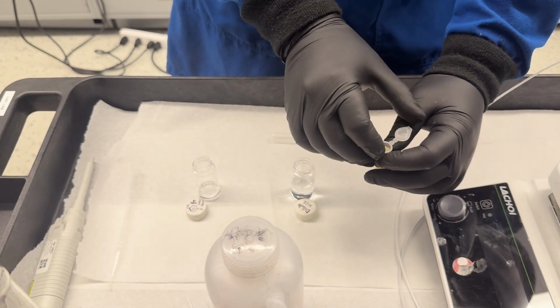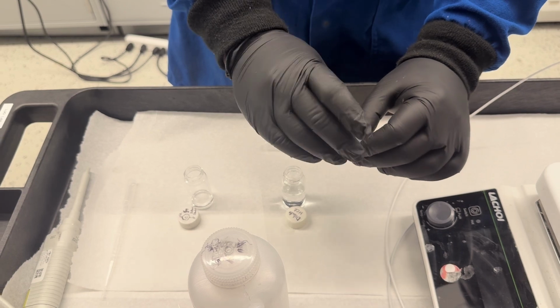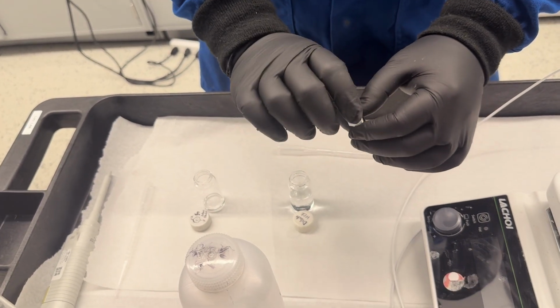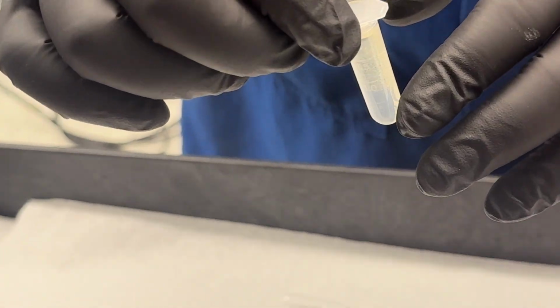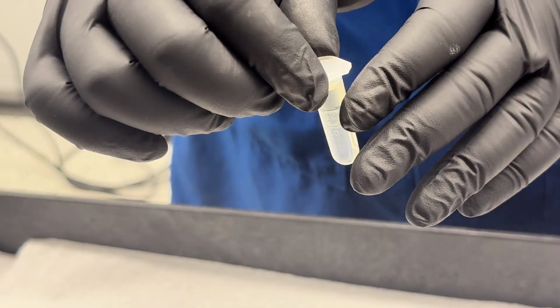After adding ethyl acetate, we close the vial and shake it so that the partition is efficient. You can see the partition was done. The top part is the ethyl acetate and the bottom part is our reaction mixture, and most of the reactant and the product should come into the ethyl acetate part.